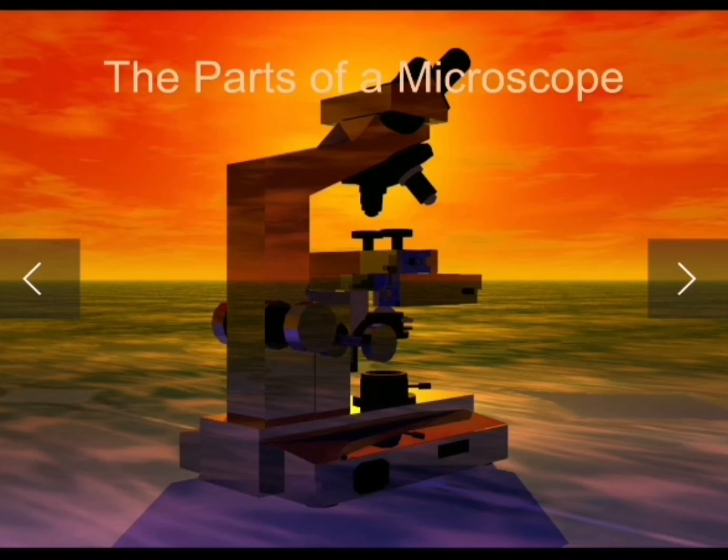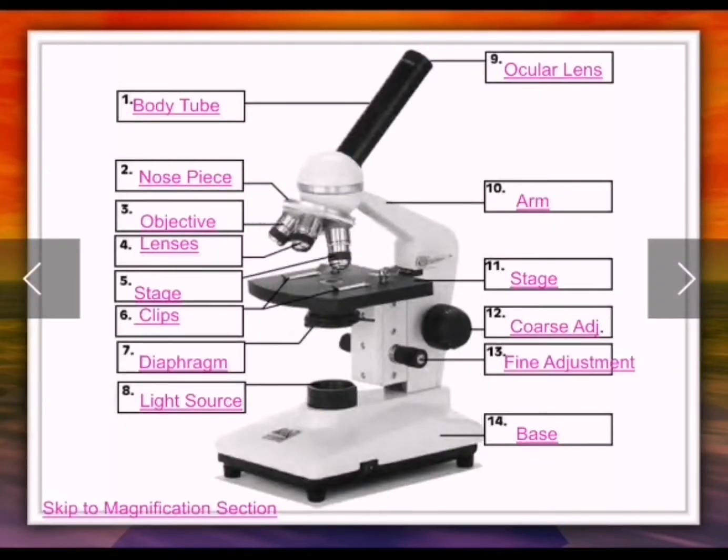So the microscope magnifies objects. The parts of the microscope. First we have the body tube, which is up there. Then we have the ocular lens, then the nose piece, then the objective lens. Then we have the arm, stage clip, diaphragm, light source, stage, coarse adjustment, and fine adjustment. Coarse adjustment adjusts the microscope with a big move, and the fine adjustment adjusts it with a small or fine movement. Then we have the base, which has the light source.